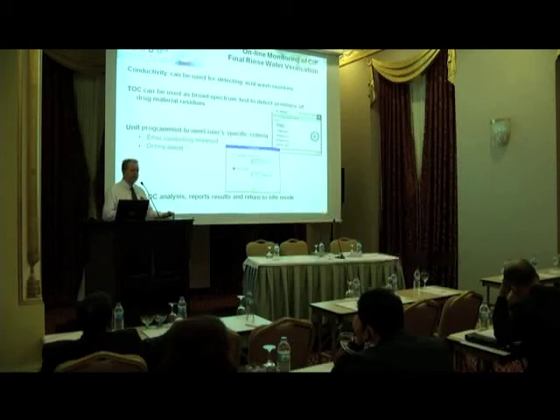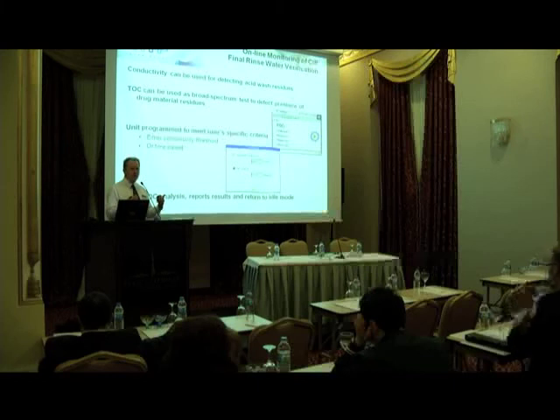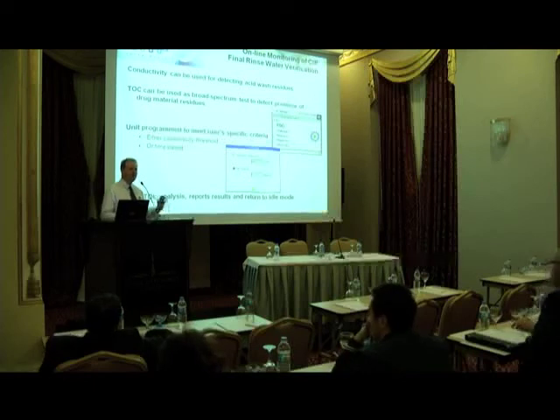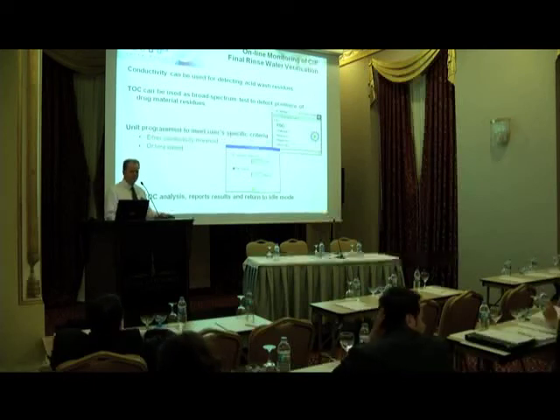This analyzer has a special routine built into it. So as I mentioned, it will measure conductivity and it will measure TOC analysis. So you can use the conductivity to measure the cleaning reagents and then use the TOC to measure the final cleanliness, to verify the cleanliness of the vessel.